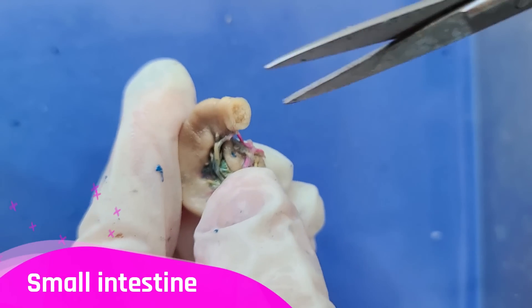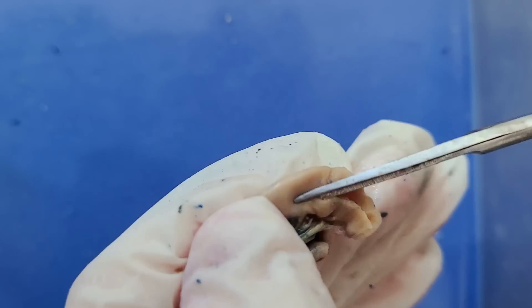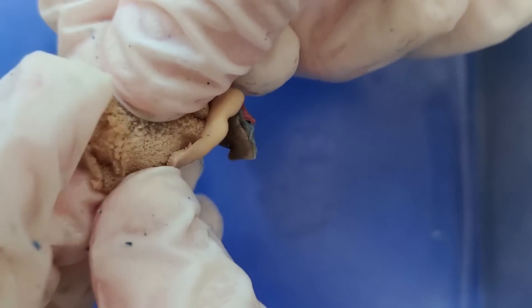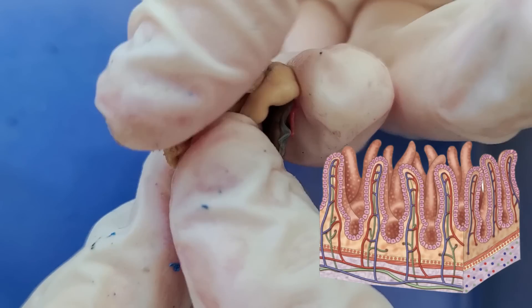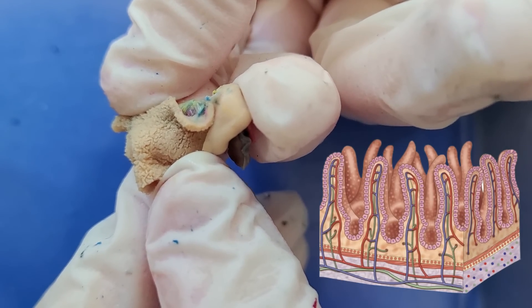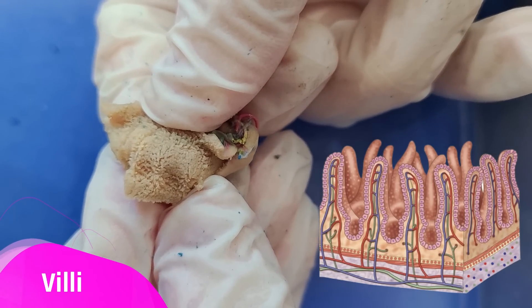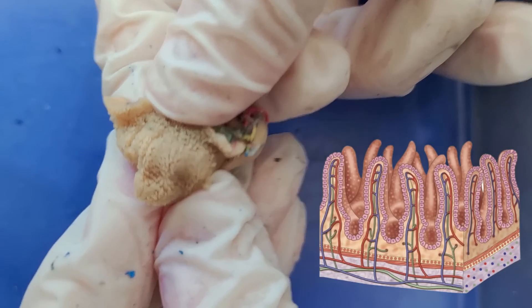This is a section of the small intestine, and I'll cut it open lengthwise as well. The inside texture is kind of fuzzy. You can see there are tiny projections coming up from the intestinal wall — kind of like a carpet. These projections are called villi, and they increase the surface area of the small intestine to help with absorption of nutrients.